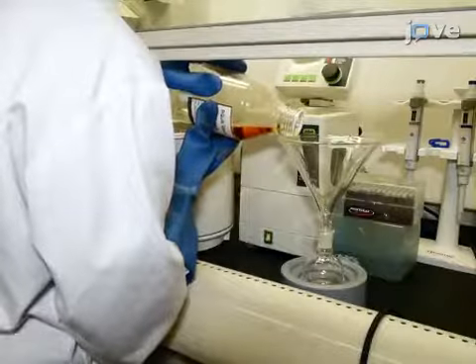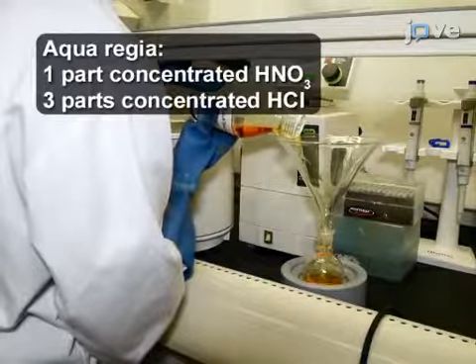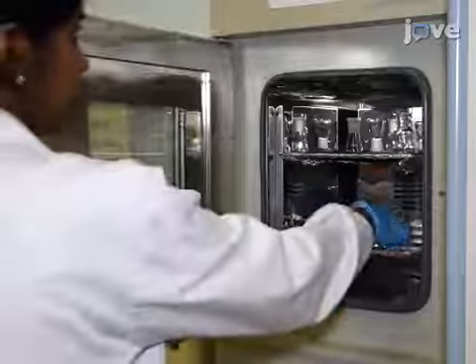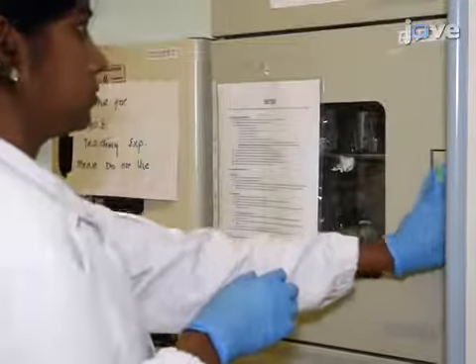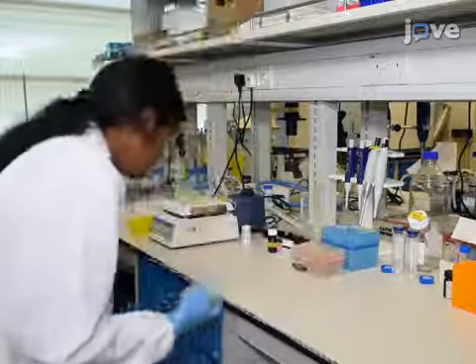First, clean a 100-milliliter round-bottom flask using aqua regia. After washing with deionized water and autoclaving, dry the flask in a hot air oven at 100 degrees Celsius for 15 minutes. Then wrap and store the sterile flask until use.